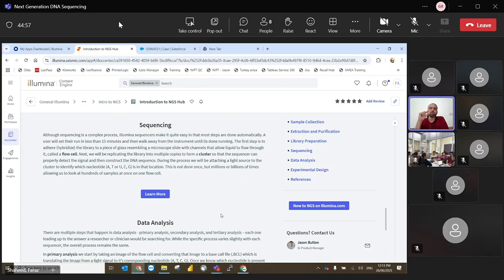So what we do on the flow cell, when the fragment of DNA comes and binds onto the flow cell, because it has complementary adapter sequences, it will hybridize on the flow cell. Then we amplify at least 1000 folds on the flow cell each fragment. So now we will have fragments with similar sequence, a cluster of 1000 fragments, and when you add dNTP to all those 1000, they all will have the same sequence because they are amplified from the same initial fragment.